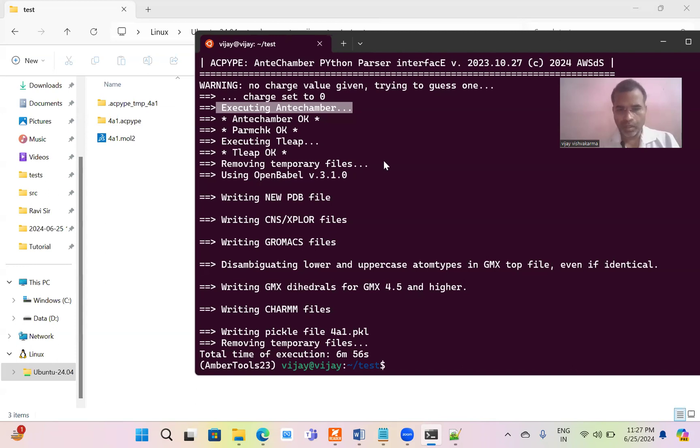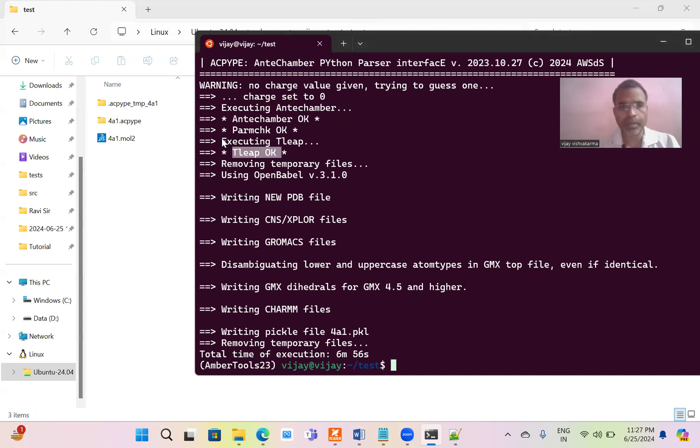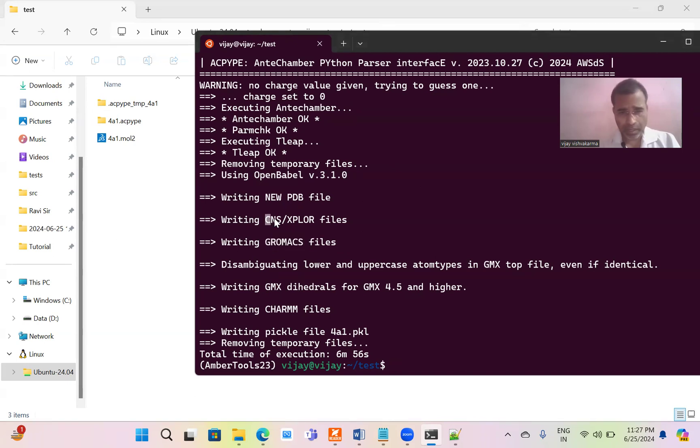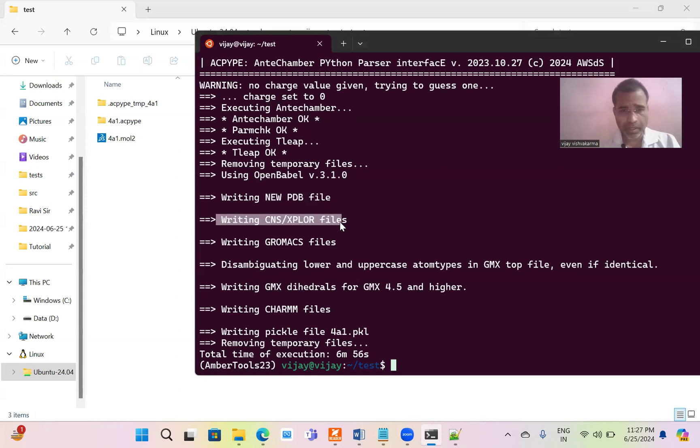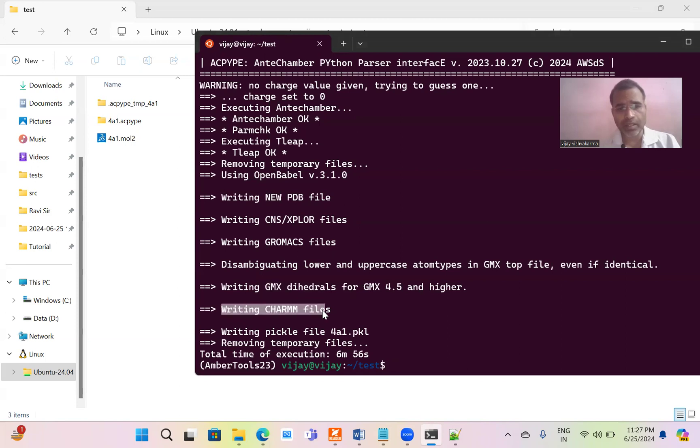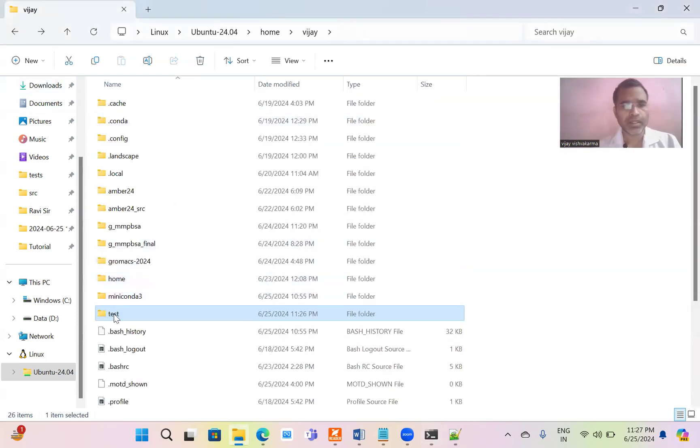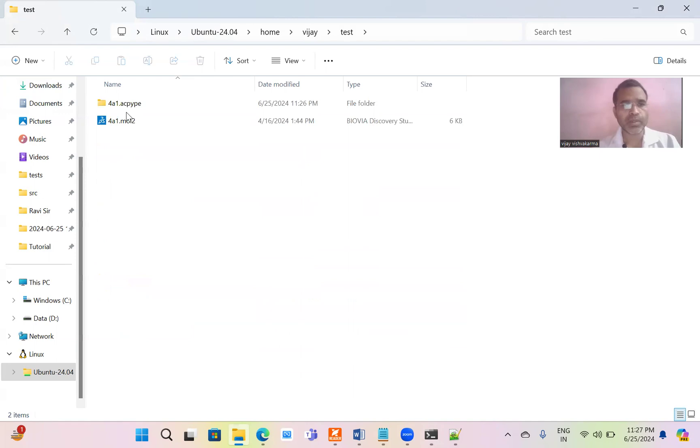Now approximately 5 to 10 minutes wait. Its execution is successful. T-leap and parmchk and Antechamber are running successfully. And it is generating the topologies for GROMACS compatible files. Also writing the new PDB file, CNS/Xplor files and GMX dihedral, writing CHARMM files. These files are generated. Now let us take a look of these files.